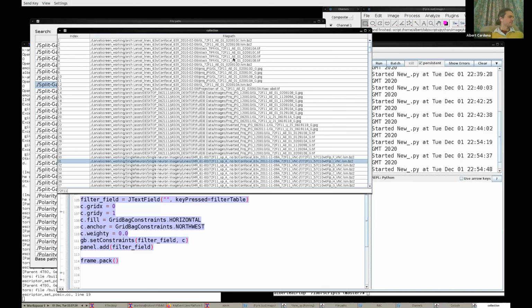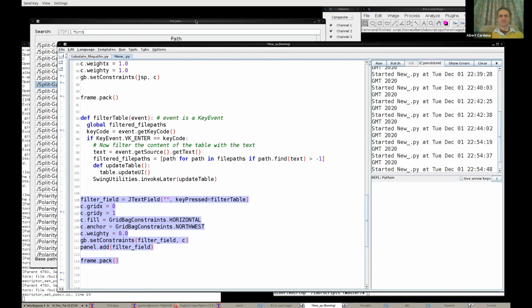So let's go back to where I was, in which I was sharing with you my desktop here. Okay, you can see the desktop again. Right, let's put this on the side here. So I'm going to close the table completely. We'll reopen it again. That's fine.